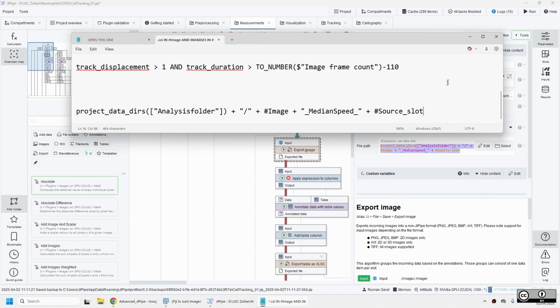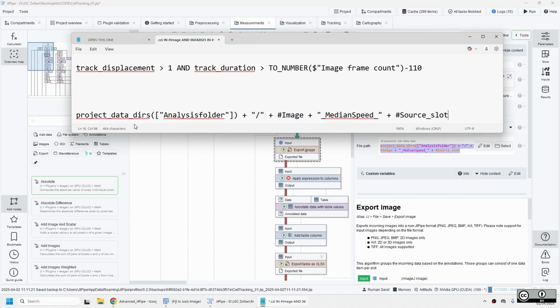So this is what we do. Basically, I want to automate the saving of this histogram because every time I run it, I don't want to have to worry about it. So I have to create a name for the saved image, and I have to create a target for the saved image. And this is where I find customized folders extremely useful. All I have to do is say, find my analysis folder, which I defined at 9:20 this morning.